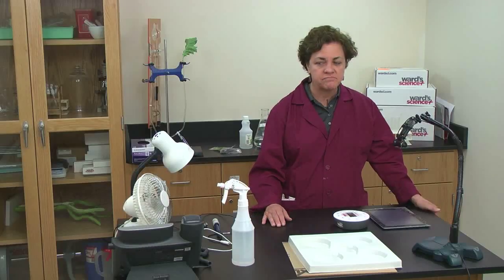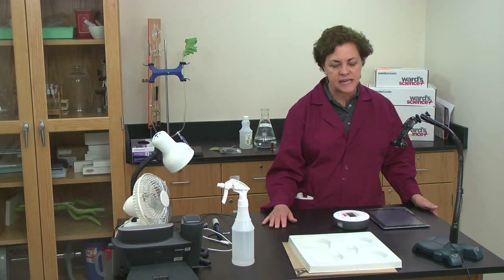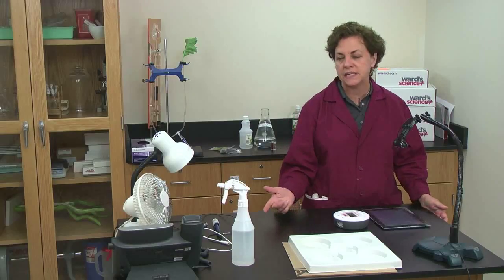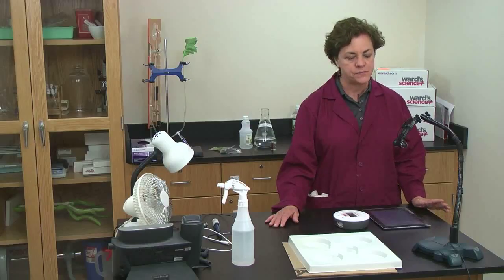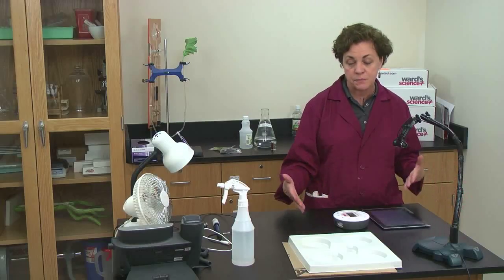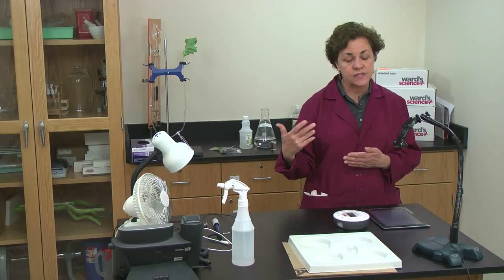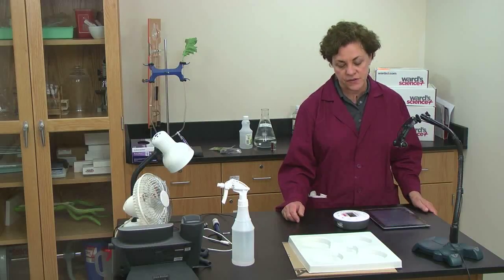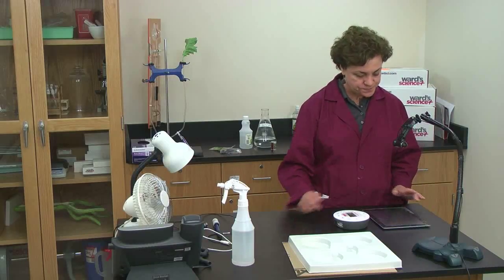Bacterial transformation, there's not much you can do with a Datahub other than maybe check the turbidity of the solution before you inoculate it onto the plates. So I started with ones that I think were examples of either checking that dependent variable or checking those independent variables that I spoke about earlier.